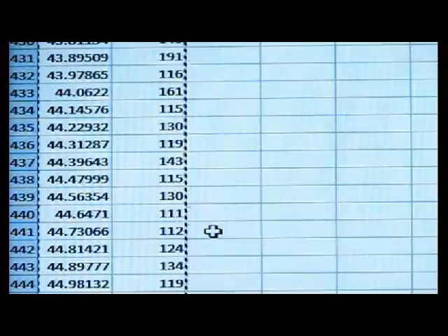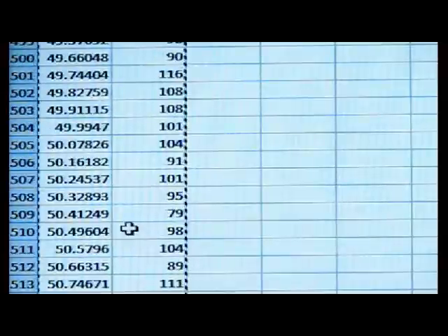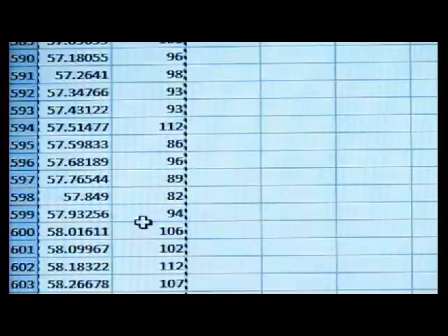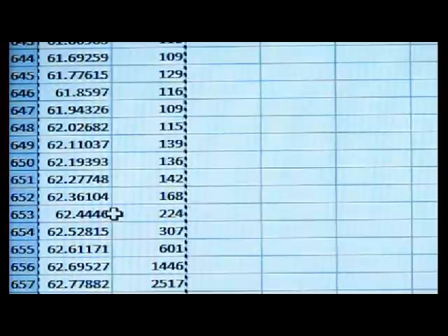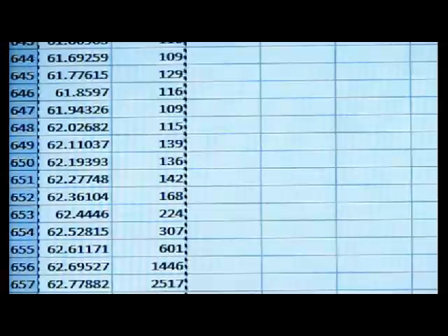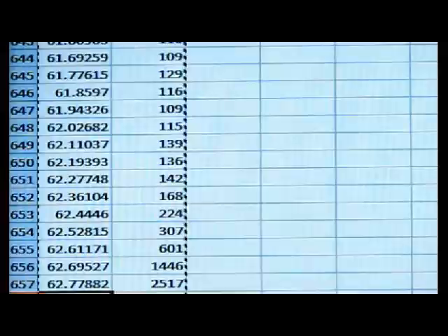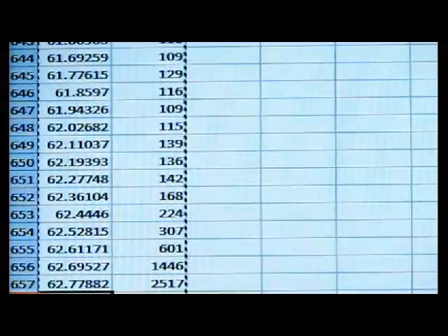Now the third peak, that is 62.84. Go to the 62.84 values. Here, 62.86238 got the maximum intensity values, that is 2613. So it is identified as the third one.